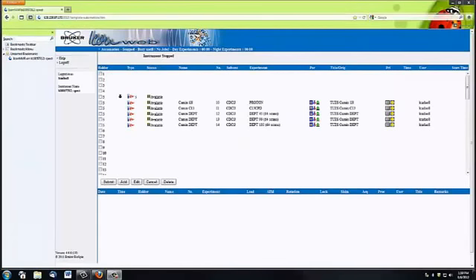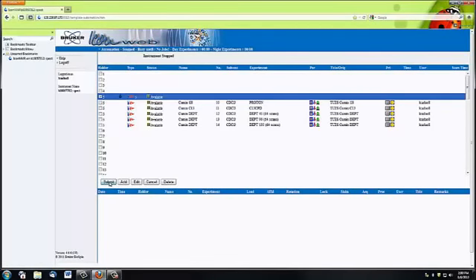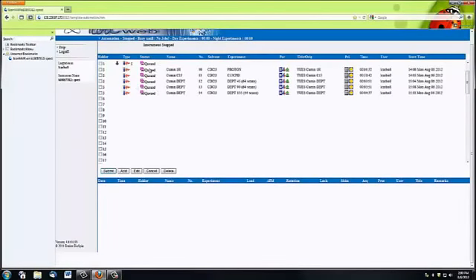The last thing you'll need to do is make sure you actually submit the experiments. Right now, you can see that under the status, they still say that they're available, which means that your experiments won't actually run. So you again need to click on your holder number and select Submit, and you'll see that all of these will change to queued instead of available.